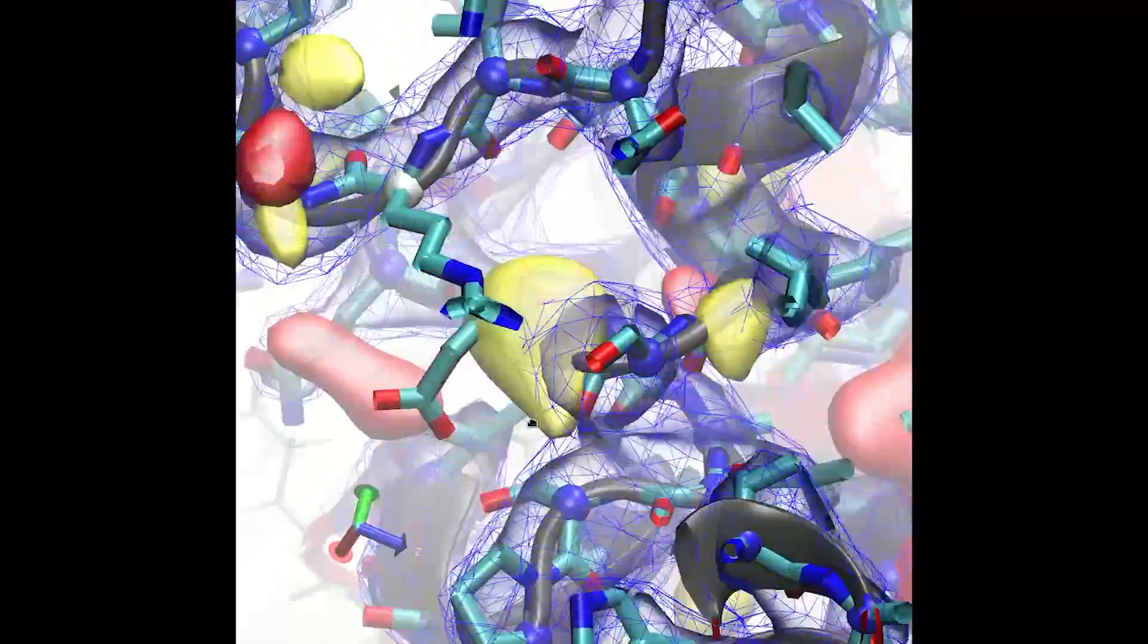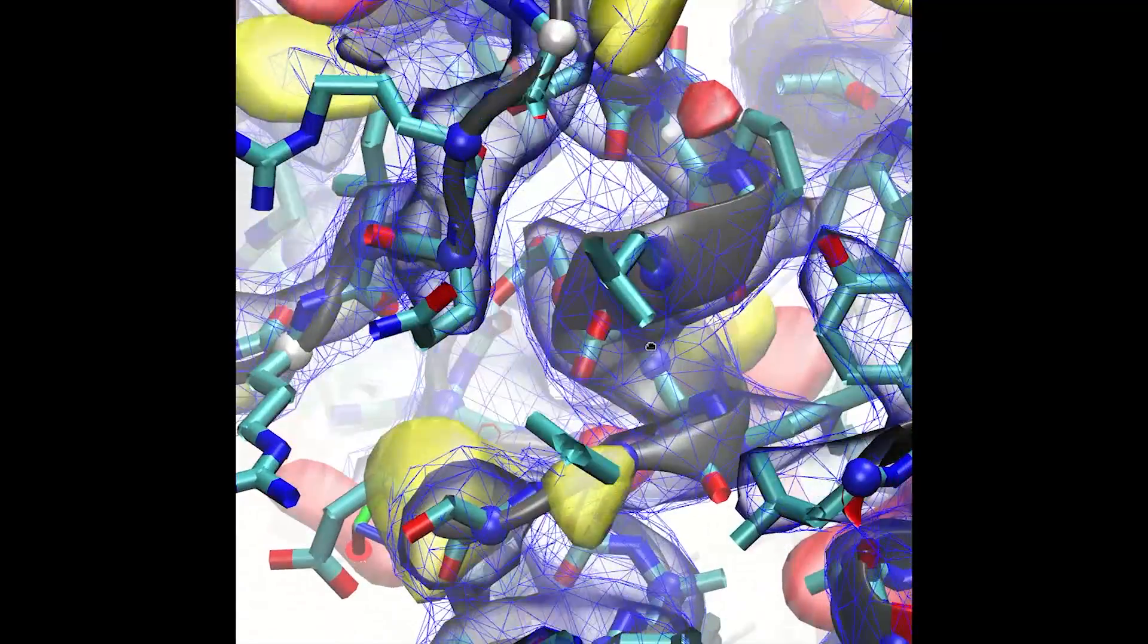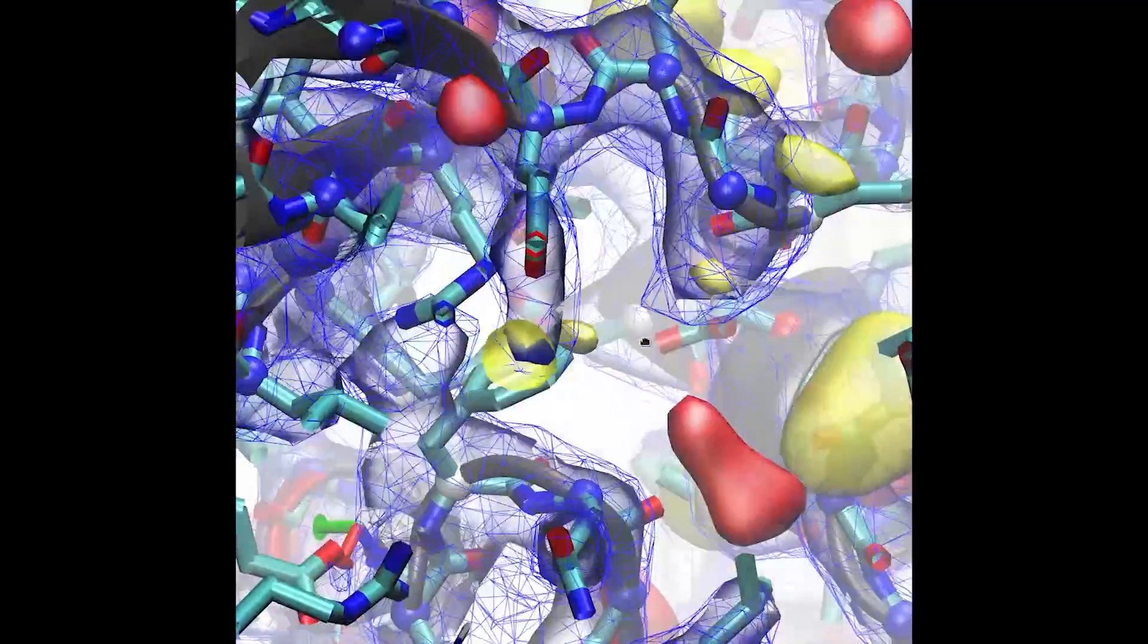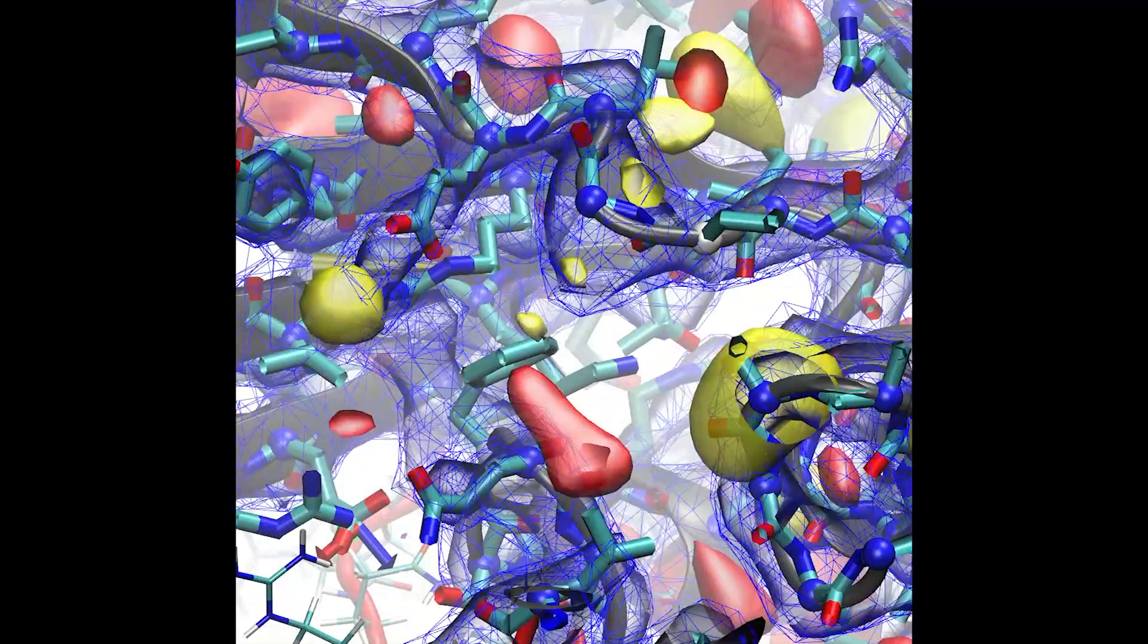If we look back at the C terminal end of the helix, we can see a much improved fit, and everything looks reasonable as we head towards the N terminus. The beta strand has mostly settled itself, and all I need to do is readjust a few side chains.